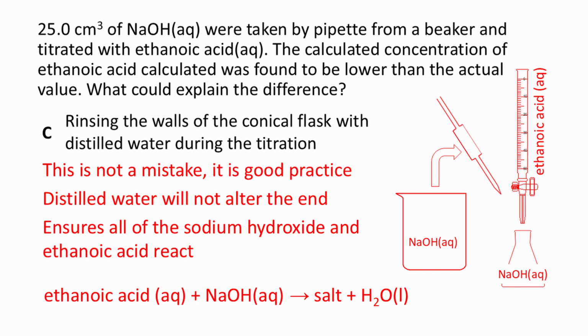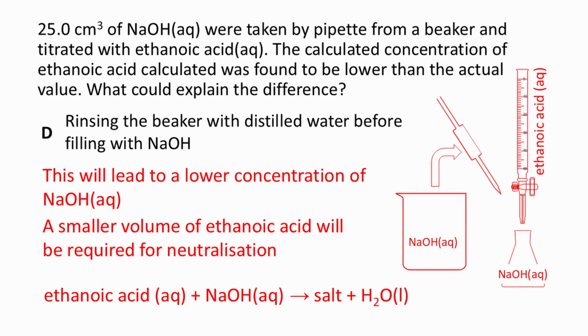to make sure. Option C, rinsing the walls of the conical flask with distilled water during the titration. This is not a mistake. It is good practice. Distilled water will not alter the endpoint and ensures that all of the sodium hydroxide and ethanoic acid react. And finally, option D, rinsing the beaker with distilled water before filling with NaOH.